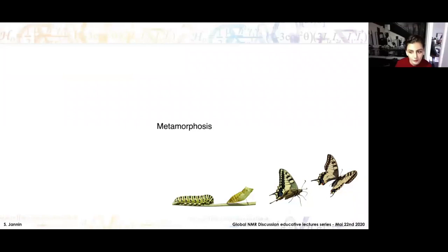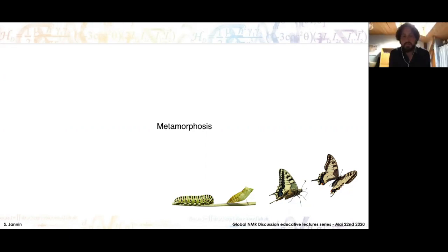And then the follow-up question is, can the paramagnetic metal affect the polarization gain of the nuclei of the coordinating ligand and reduce the gain from DNP? Okay, so if you have a paramagnetic protein and you want to measure the binding with a hyperpolarized ligand, then I guess it may affect the relaxation of your ligand and increase your contrast, I guess.